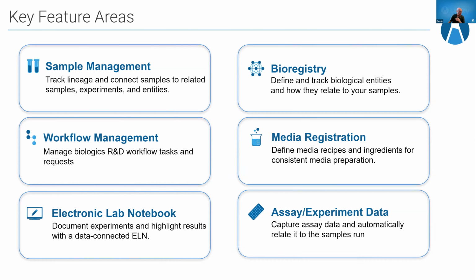So maybe with the asker of this question, we could spend a little time digging into exactly what your particular work lists look like and how it would be useful for that to flow in or out of the system.